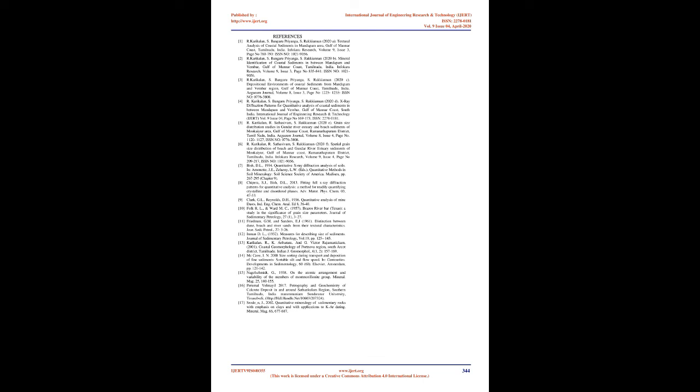6. Conclusion. The mineralogical studies exhibited quartz, mica, feldspar, sillimanite, hornblende, garnet, biotite, and microcline derived from the host rocks of granitoid gneisses, MgAl granulites and sandstone. This work concluded the variation of mixed sediments deposited by waves, longshore current, wind and fluvial process. This work demonstrates the different origins of sediment deposition.